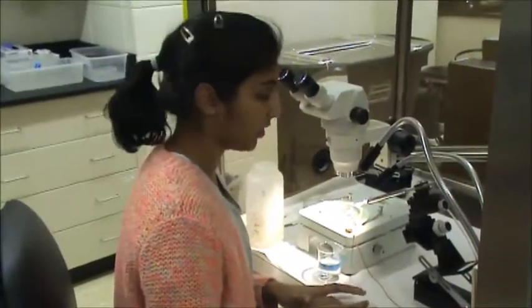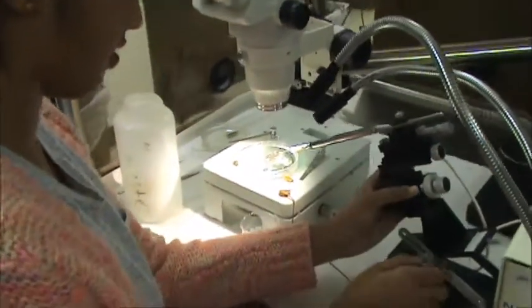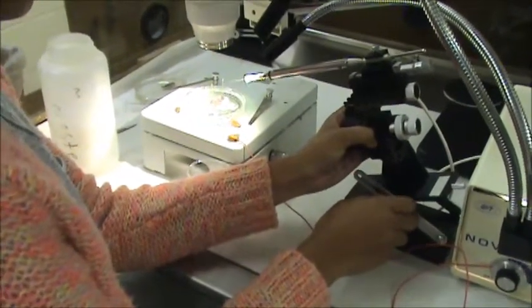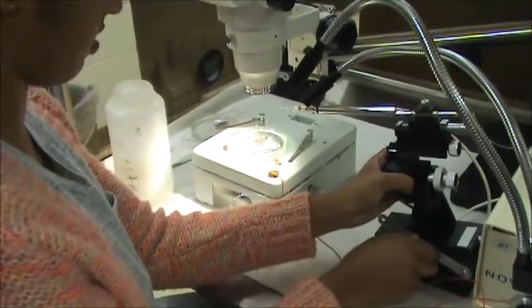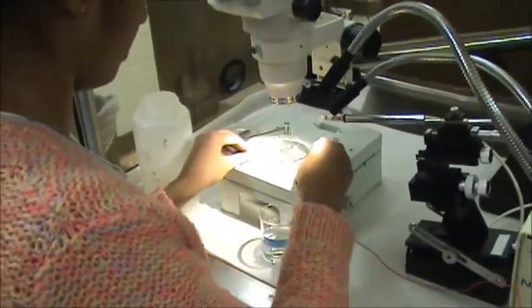So after you got your 3 readings, you're going to want to carefully back out the electrode from the muscle fiber, and then you're going to want to hold on to the manipulator and gently loosen this so you can pull it out. If you go too quickly, the electrode's going to break in the solution, and that would be a problem. So then you're going to want to take this ground out and take out the clay.